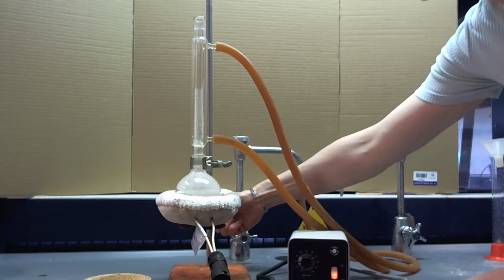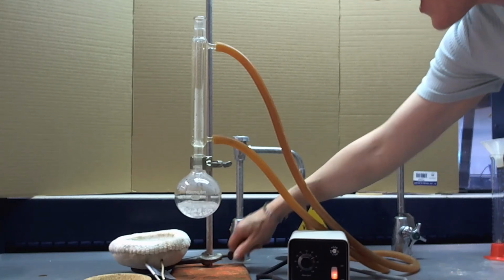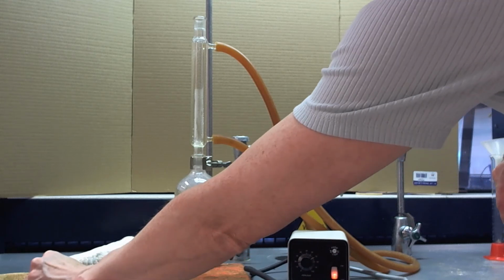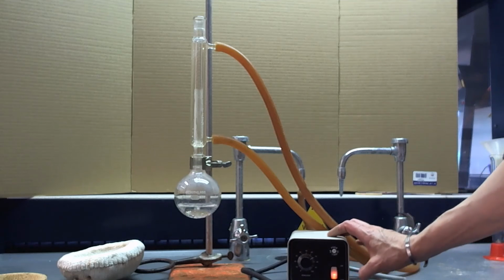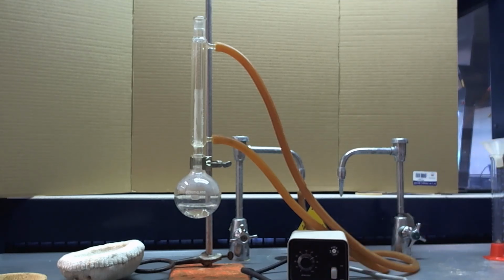I can reach behind the setup, unscrew the ring clamp, and without even touching the heating mantle, get it far away. Okay. You don't want to burn yourself by touching the heating mantle, so you could also use the cord to remove it farther. Okay, so that's the fastest way to cool a reaction, just simply take away the heating mantle. So I do that at the end of the reaction as well as turning it off. See how the boiling is slowing down? Once the boiling has stopped, then you can turn the water off back here.